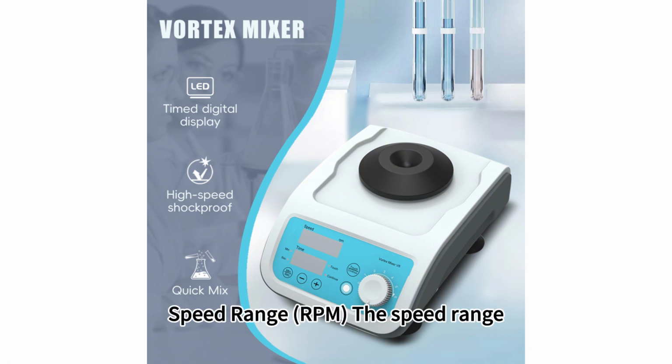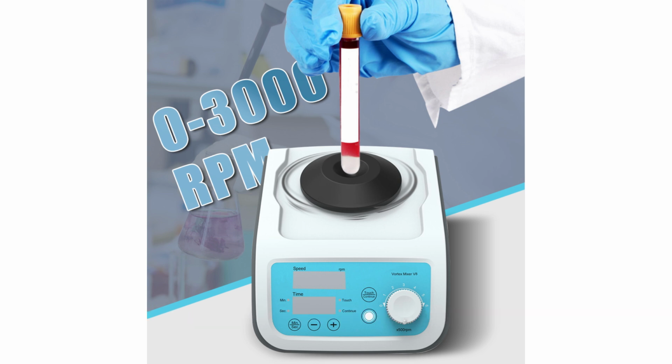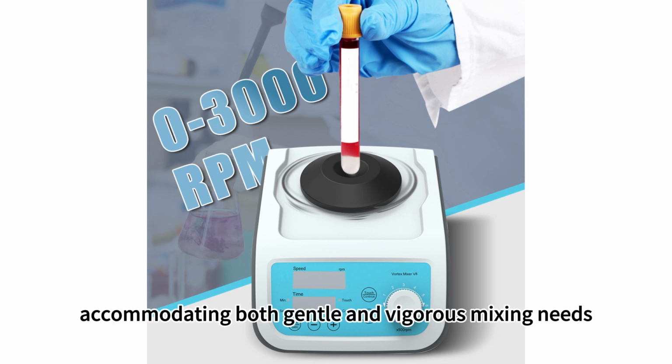Speed range, RPM. The speed range, typically measured in revolutions per minute, RPM, indicates the mixer's ability to handle different mixing intensities. A wider speed range allows for greater versatility, accommodating both gentle and vigorous mixing needs.